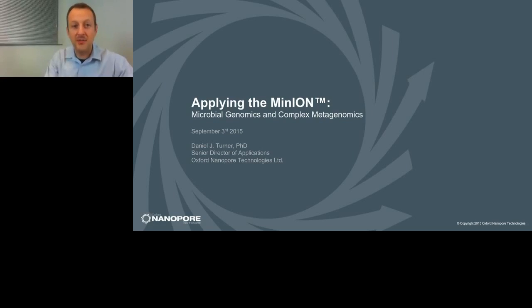Great. Thanks very much, Brenda, for the introduction. And thanks everybody for tuning in as well. As Brenda said, my name is Dan Turner, and I'm Senior Director of Applications at Oxford Nanopore Technologies. I'm assuming that some people watching this presentation will know a fair amount about Oxford Nanopore and the technology, but also that some people won't know a thing. So I'm going to spend the first few minutes talking about what the technology is and how it works.